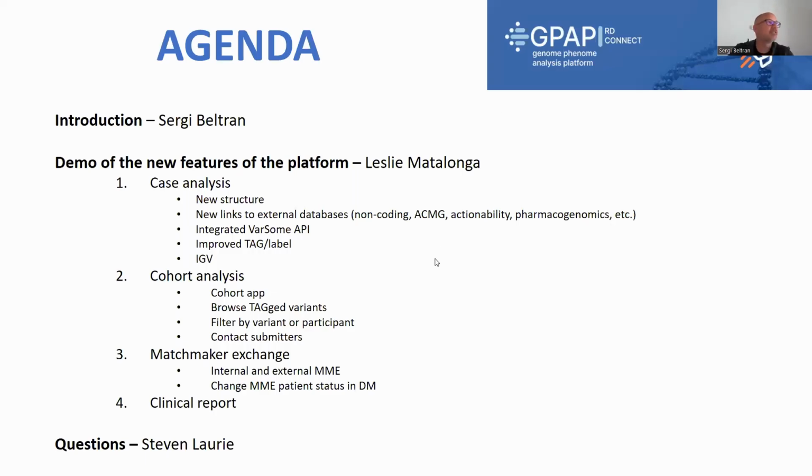I'll share very briefly the agenda here. So I'm just going to be giving you a very 2-minute introduction, which I'm doing now, about the webinar today. Then Leslie will be using the bulk of the time to present the new design of the platform. She will go through a case analysis, through a cohort analysis. She will briefly show also Matchmaker Exchange, how to generate a clinical report.